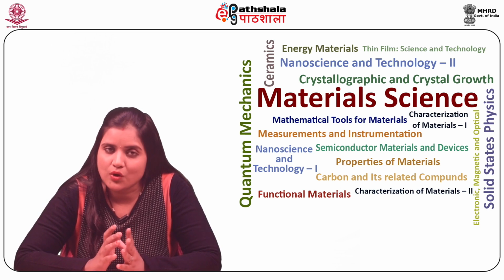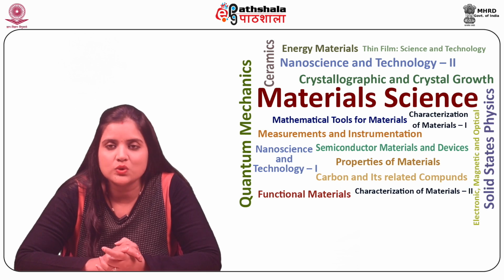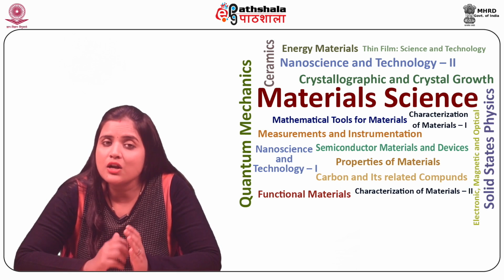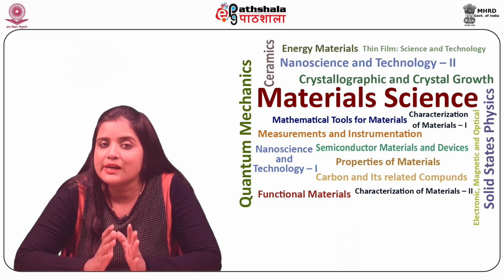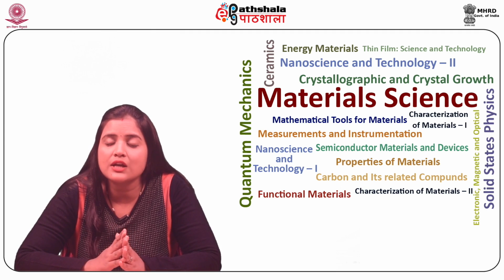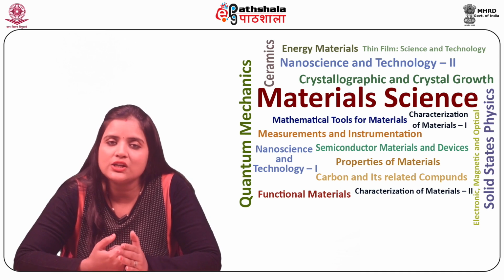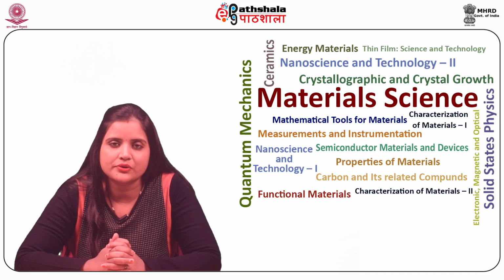Coming on to the disadvantages, regular cleaning is required for appropriate functioning. Also, the chances of contamination by dust or other outside particles are high when the cements or adhesives employed for containing the oil under the slide are not properly placed. Then the cement may dry on the microscope, leading to degradation of the lens or other parts of the microscope.